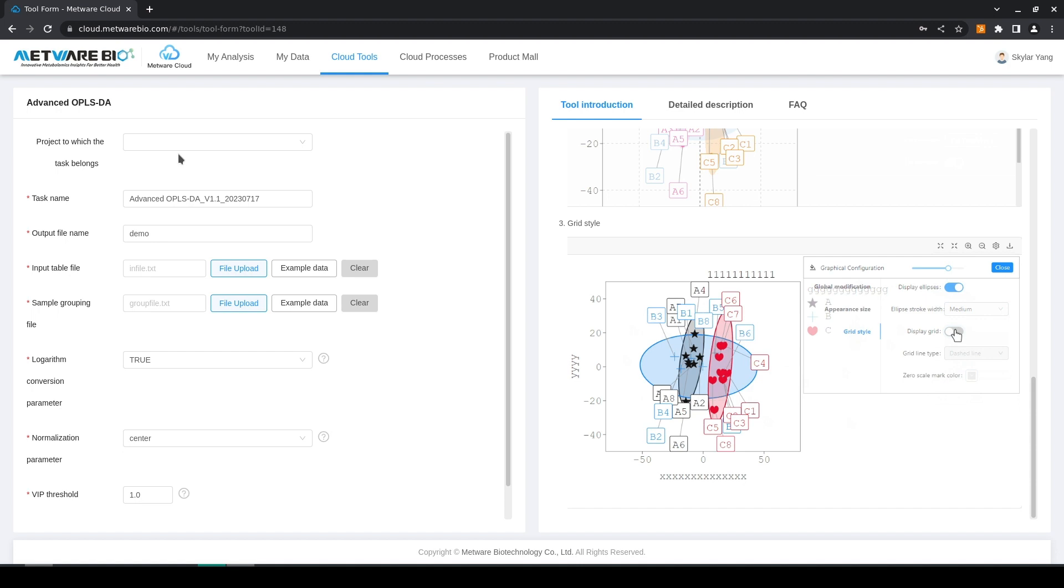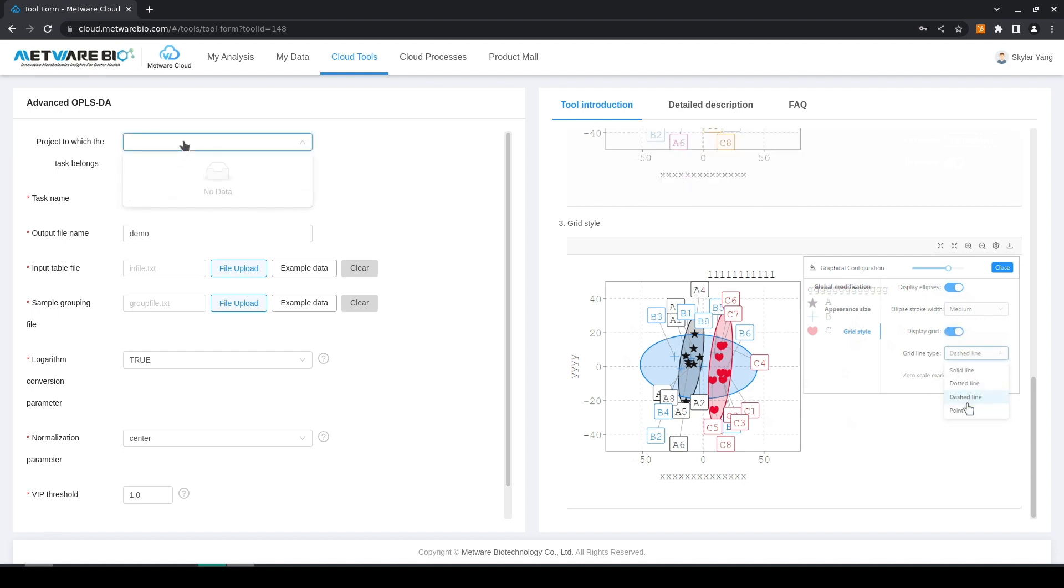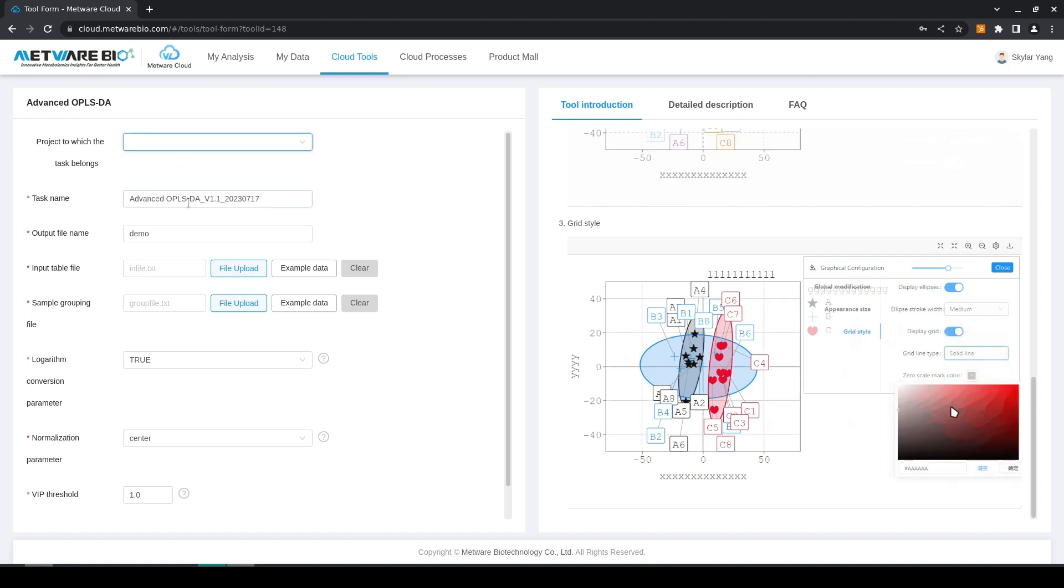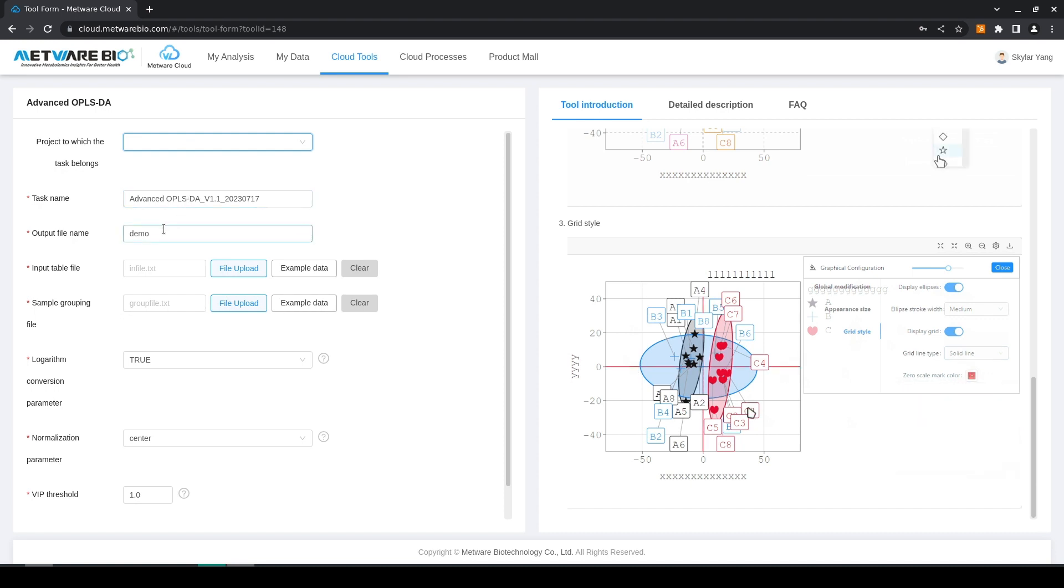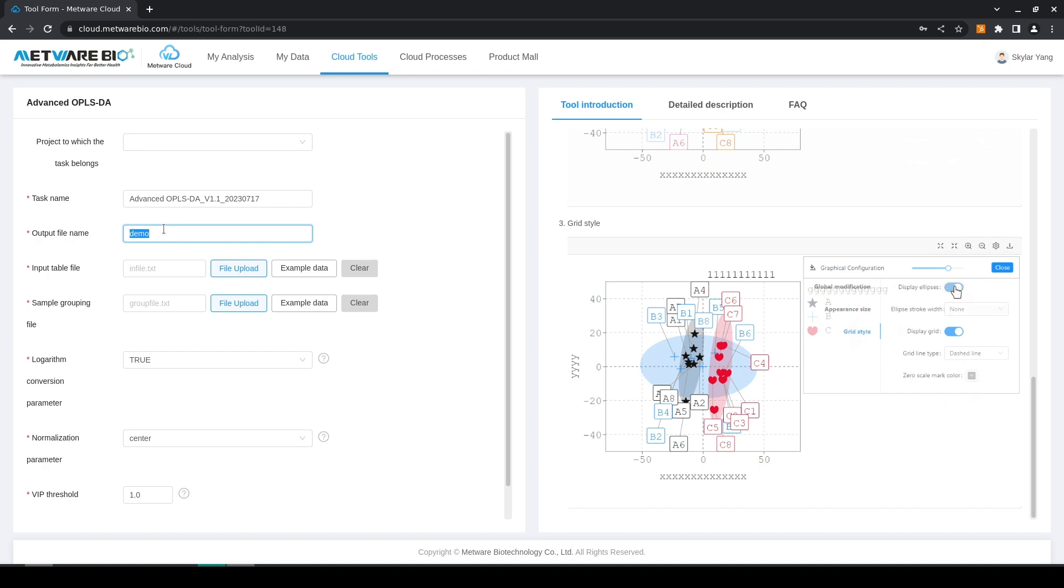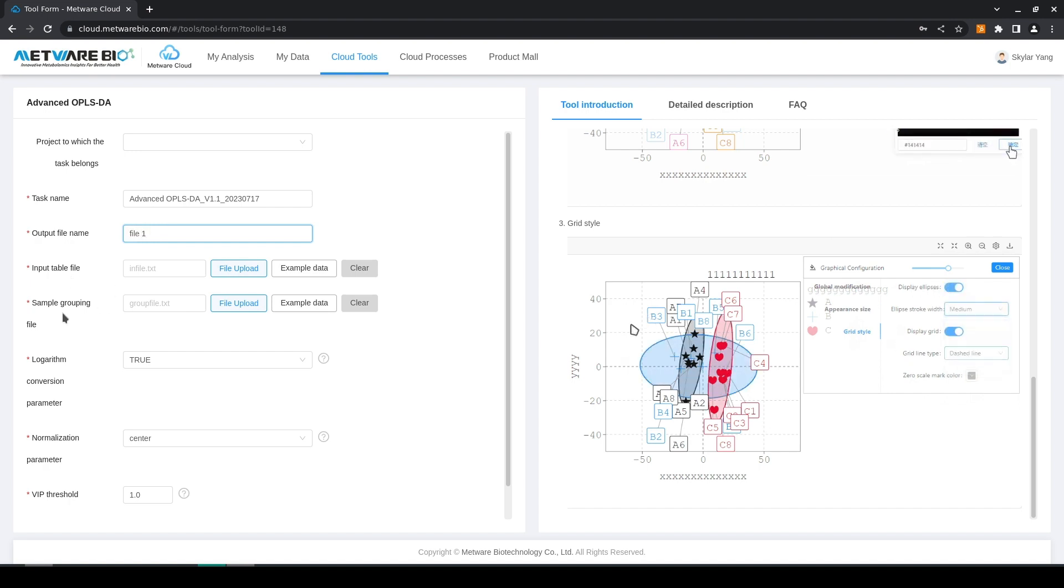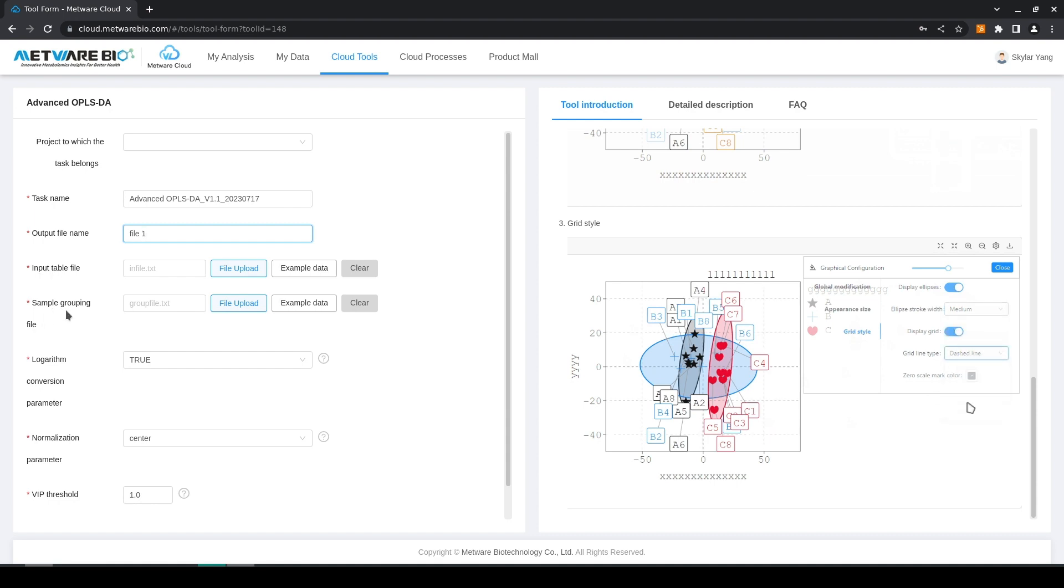Each task can be part of a larger project. In this case we don't have one. Here we have the name of the task, we can edit the name of the output file, and here we have our two input files: an input table file and a sample grouping file.